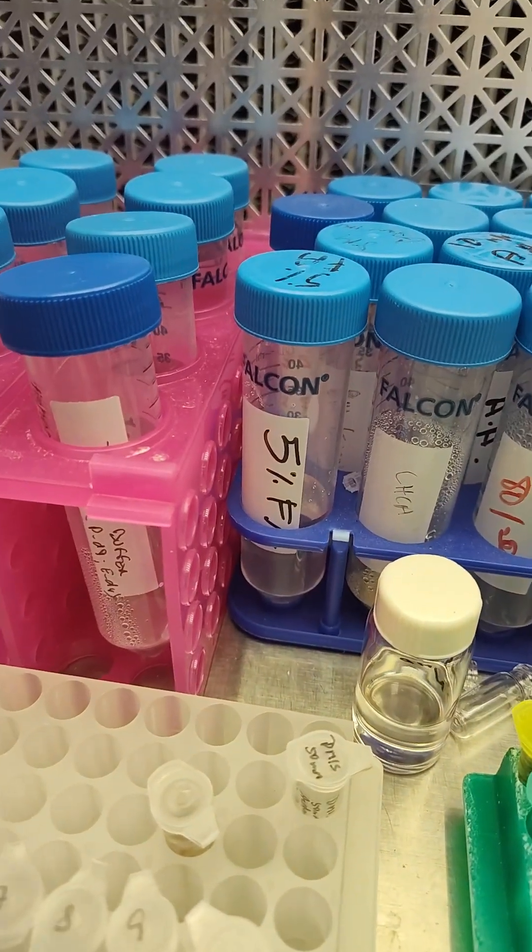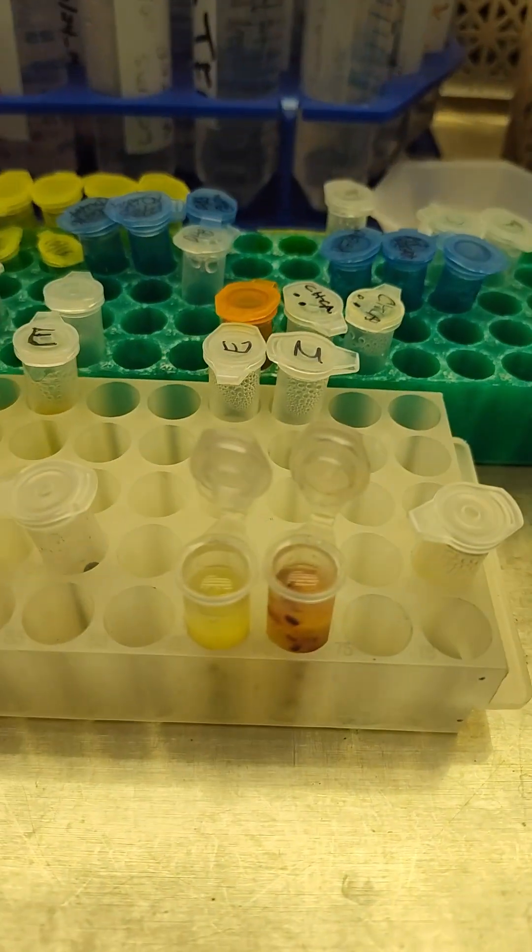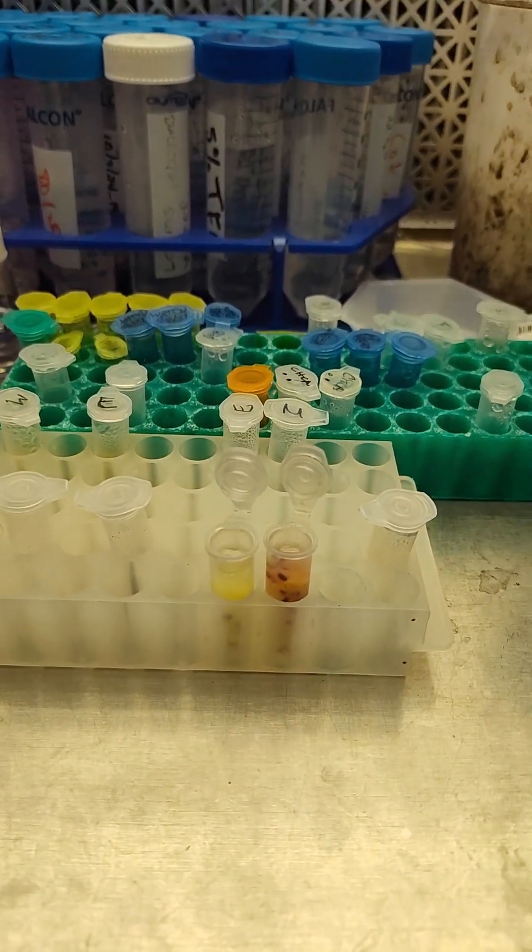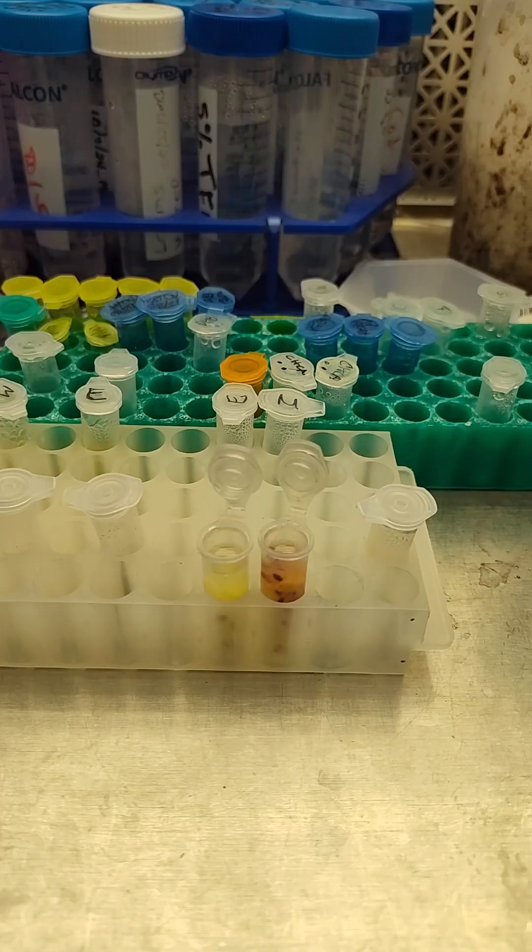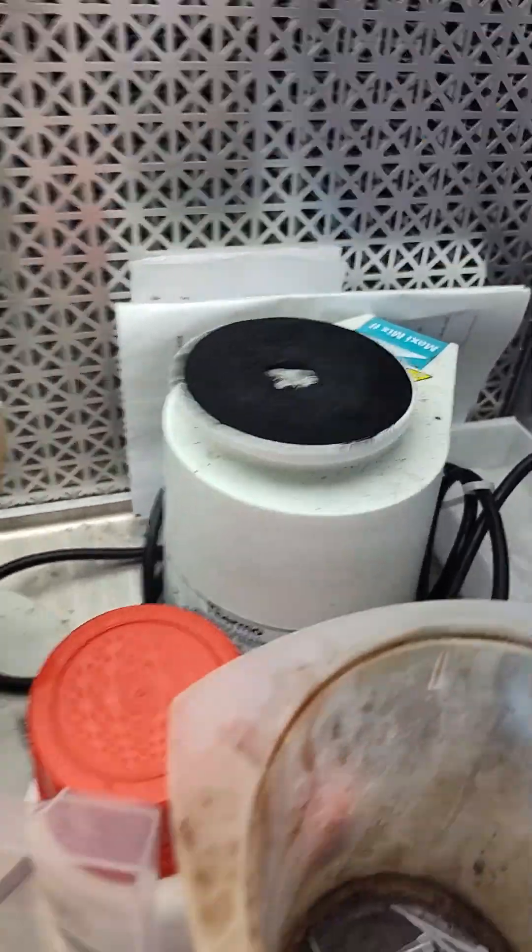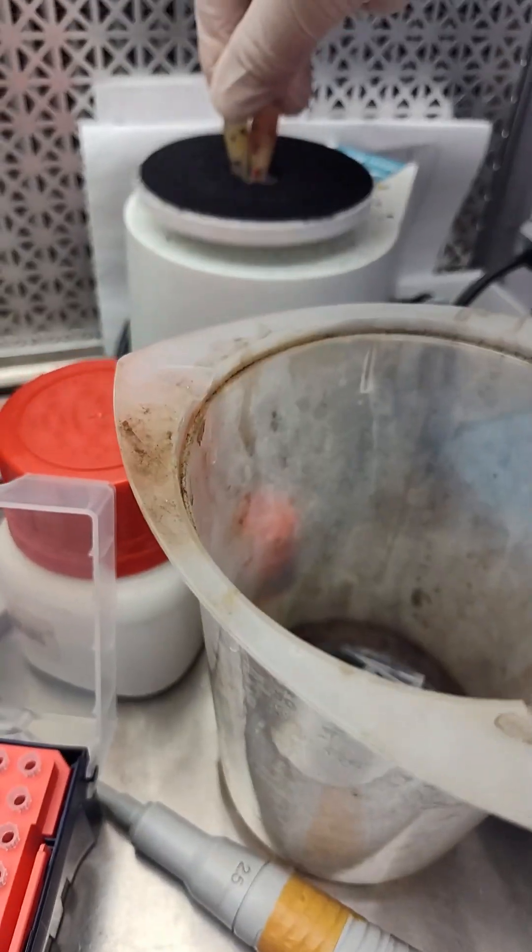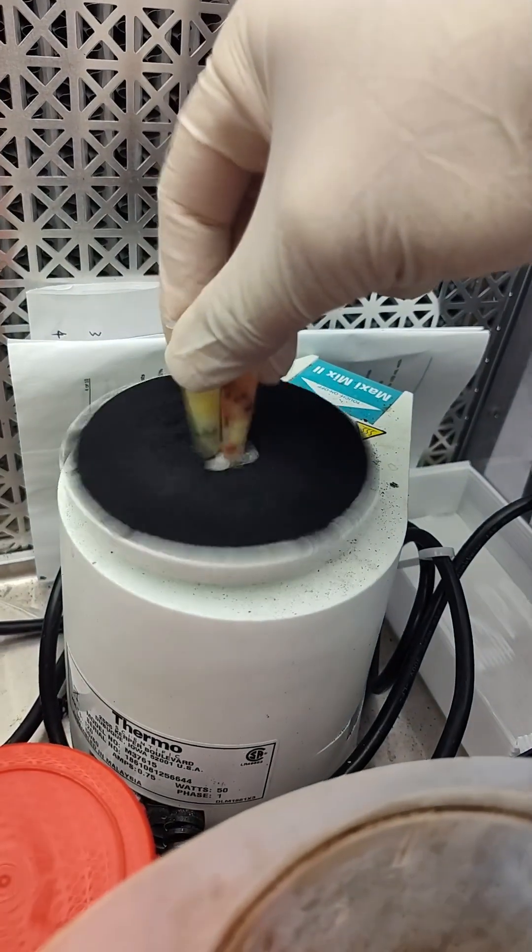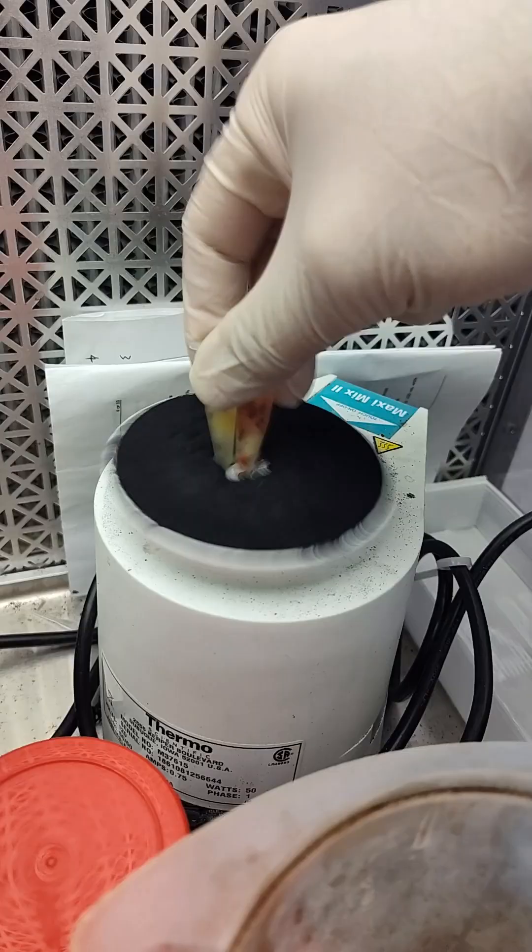You want to acidify it with this 5% formic acid because anthocyanin pigments are more stable at low pH, in acidic conditions, and we have to use formic acid on LC-MS. So now we're going to vortex these to try to get that formic acid mixed all the way down.